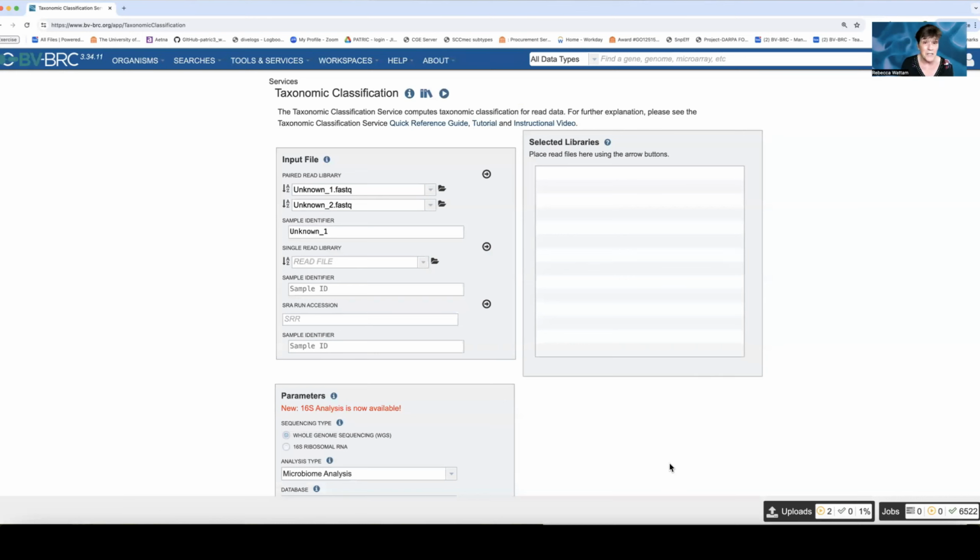Now it would be convenient if I could click on them both at once to upload it, but I can't. So let's just wipe that out of our mind. We don't even want to think about things we could do when it's impossible. So if I click on the uploads, it tells me this one's at 3%. This is going to take a while.